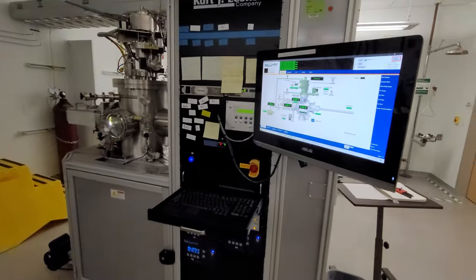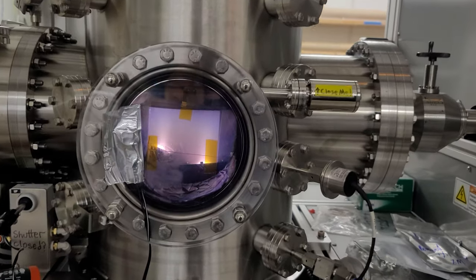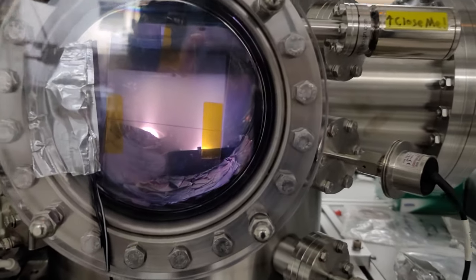As substrates such as quartz, silicon, conductive FTO-coated glass, plastics, and silicon nitride windows can be utilized, the same materials can therefore be studied by a variety of different advanced characterization methods, including optical and x-ray spectroscopy, electron microscopy, and photoelectrochemical testing.